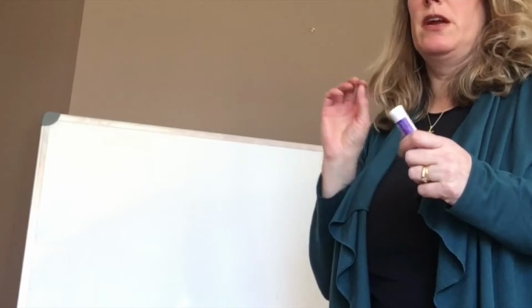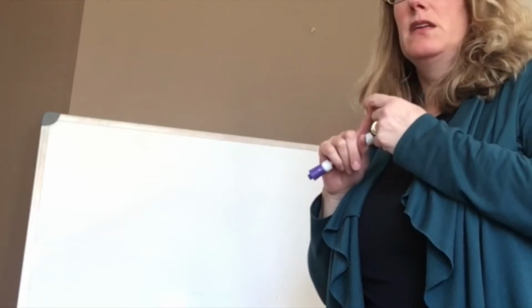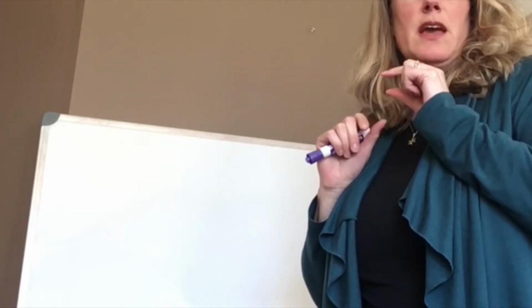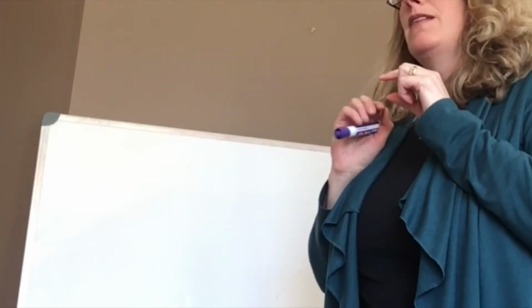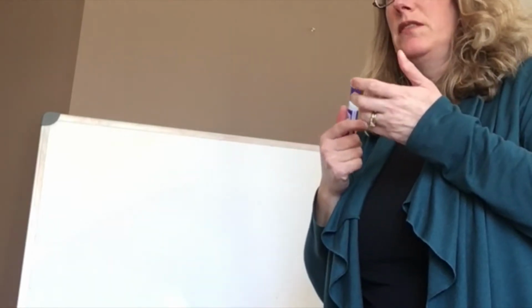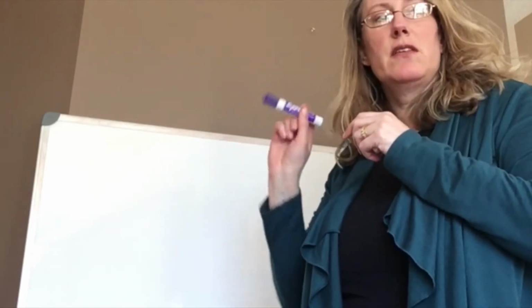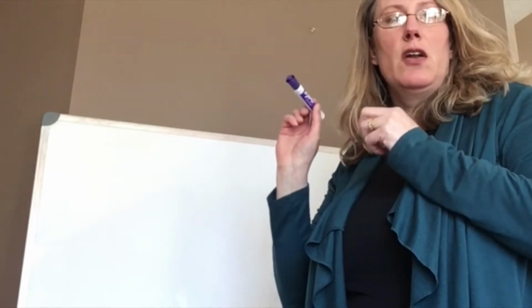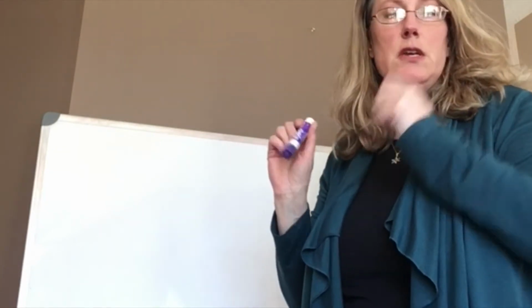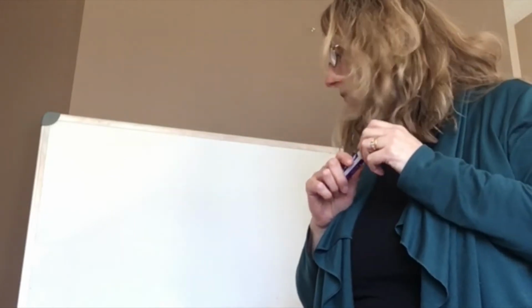For the people who aren't here, we started our lab 2-2, and we have weighed a little piece of metal, and we're heating that up in a pot of boiling water, and you should remember that boiling water is 100.0 degrees Celsius. All right, so last week we talked about converting from Fahrenheit to Celsius, from Celsius to Fahrenheit, and also from Celsius to Kelvin.